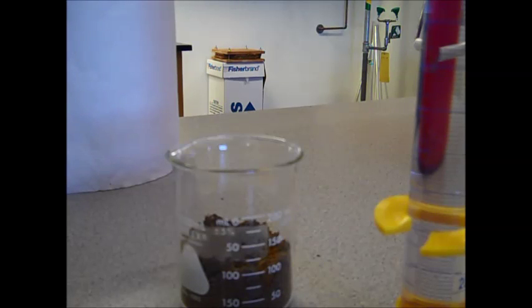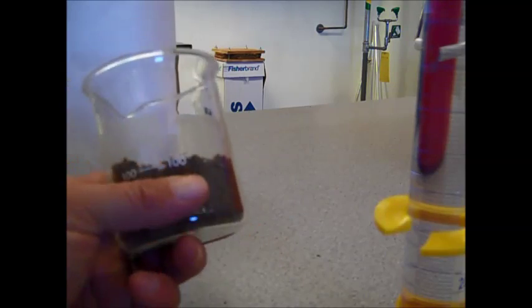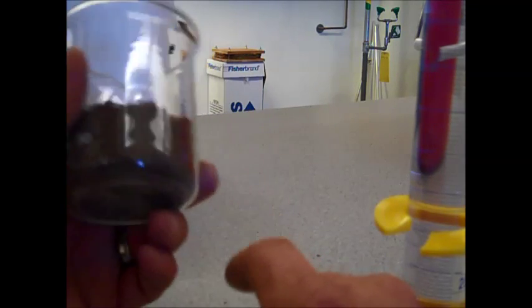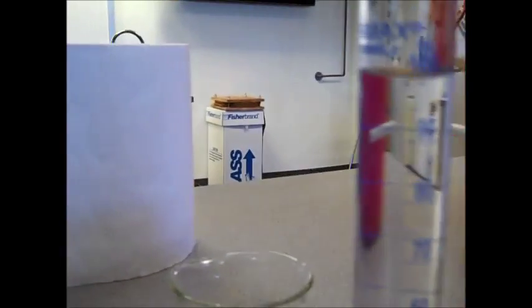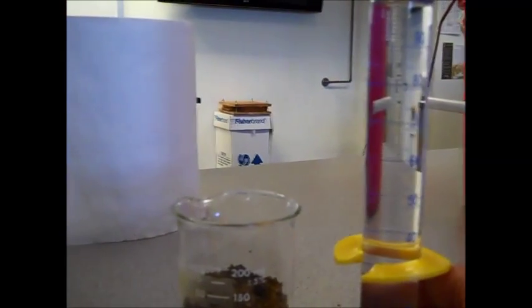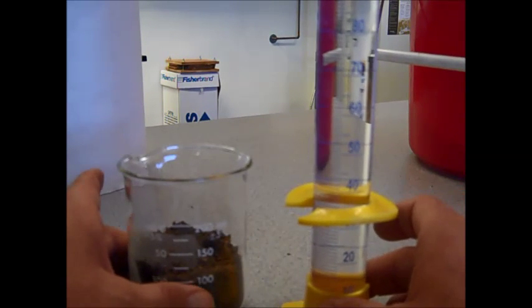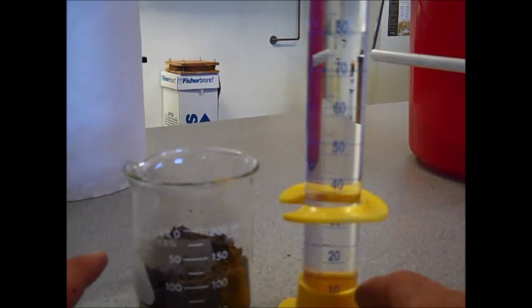Okay, now we are going to look at pore space testing. What I've done here is I've put 100 milliliters of soil into a beaker, and I've put 100 milliliters of water into a graduated cylinder. You may be saying, I don't have access to these kind of measuring devices. So let me tell you what I can do to make it super easy.